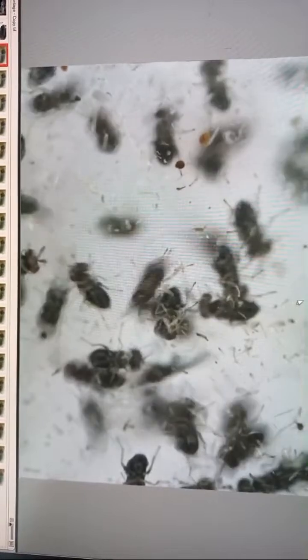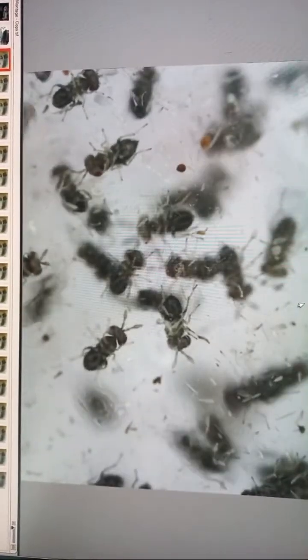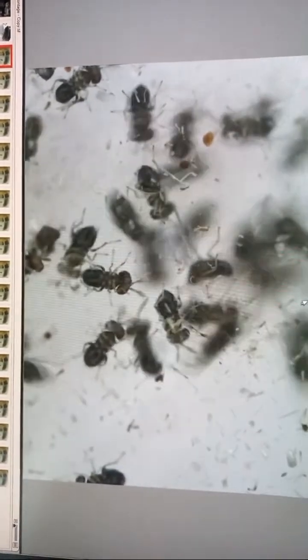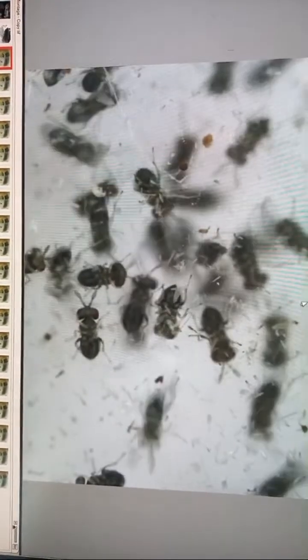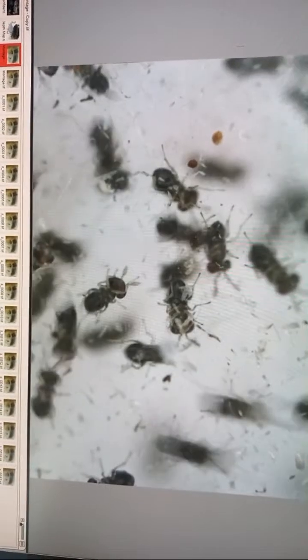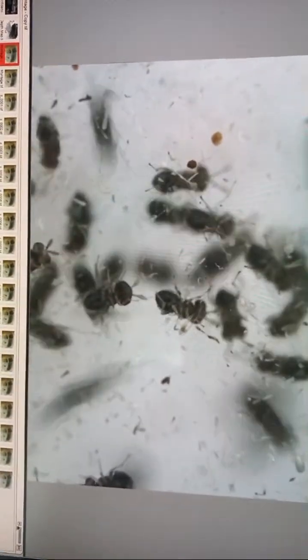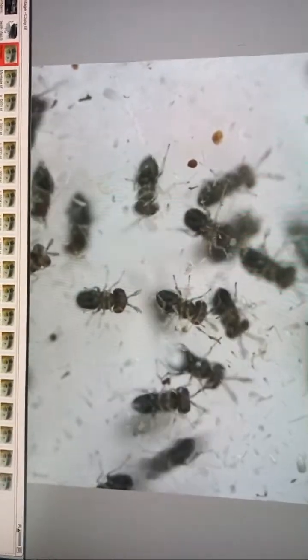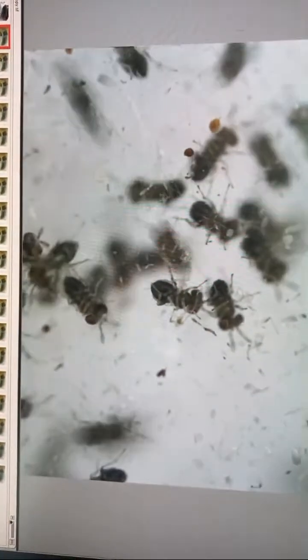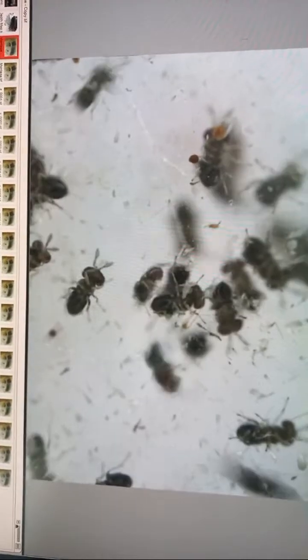And this species is used also against corn moth actually in summertime, because now it's a late autumn. This is late October. We don't find these parasitoids outside because it's cold. Nighttime about +5 and daytime +12 degrees Celsius. This is laboratory culture of small parasitic wasps of genus Trichogramma.